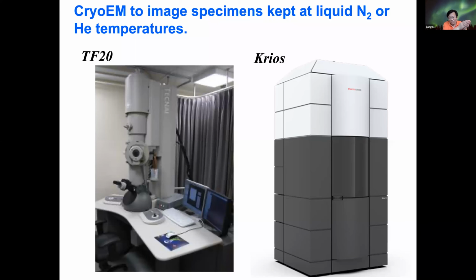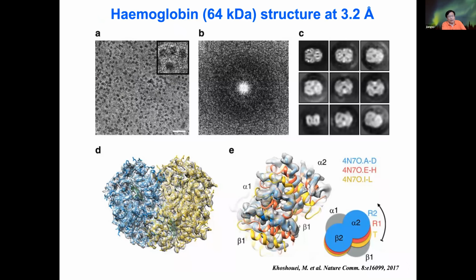The modern microscope is much more stable and has a lot of other advantages in optical properties, so that data collection is automatic, much faster, and can continue for an extended period of time. This makes it easier to collect enough data to deliver an atomic resolution structure.